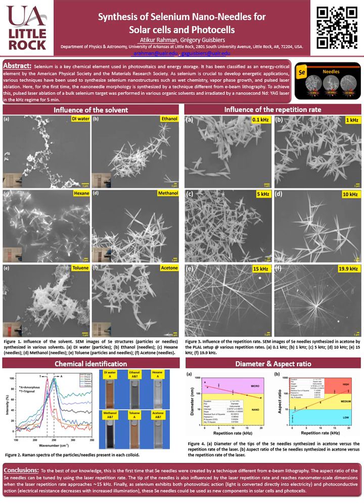The title of my project is Synthesis of Selenium Nanoneedles for Solar Cells and Photocells. In this project we will see how we can synthesize nanoneedles, how they grow, and how we can change the size and shape of those nanoneedles.